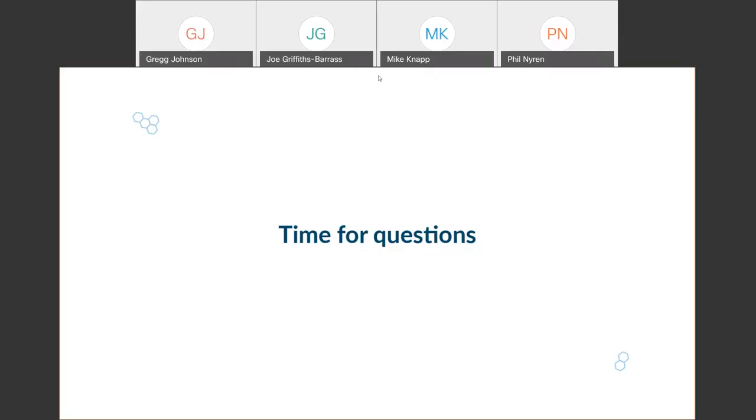Okay, I think the single-use fan club are in, because someone else has asked, what are the sterility options for the single-use sensors? Yeah, there are a variety. They typically come packaged in clean room type situations at the very minimum, but they also can be gamma treated. That's also an option that sometimes folks like to exercise. You just have to make sure that you go with a PVDF type of material versus the PFA, let's say. And again, the applications team members can walk you right through that.